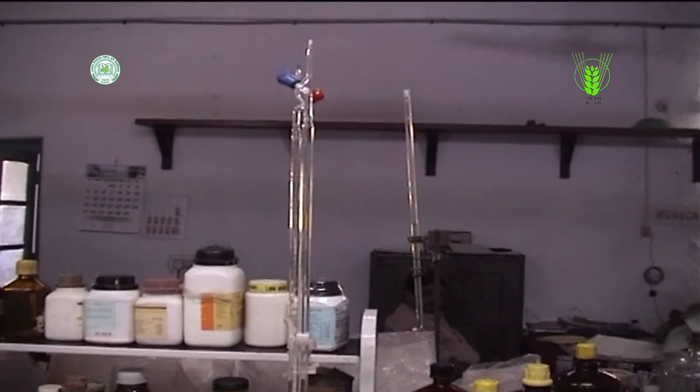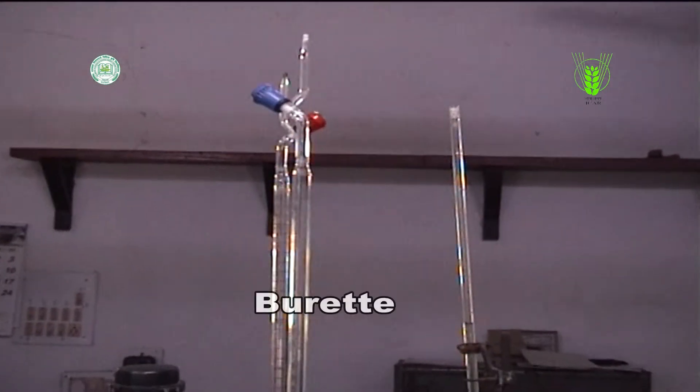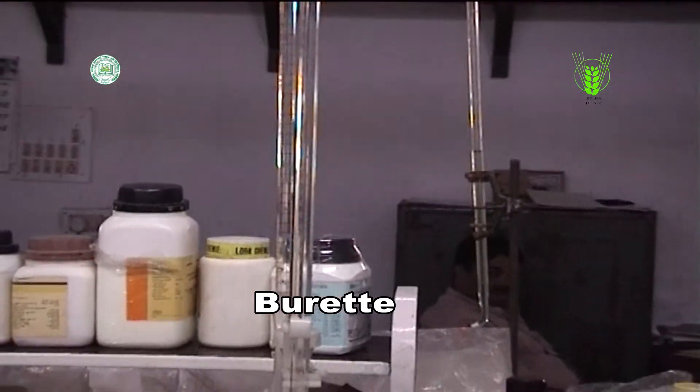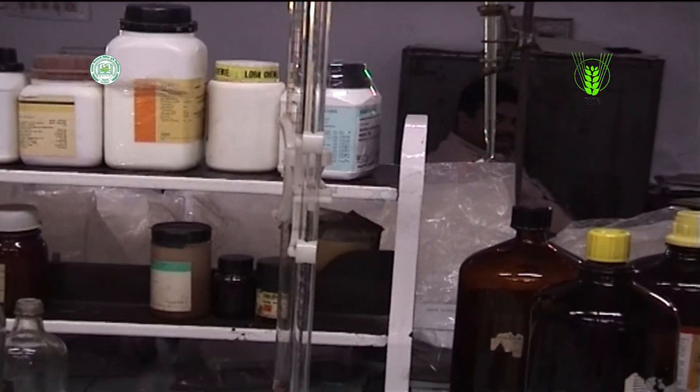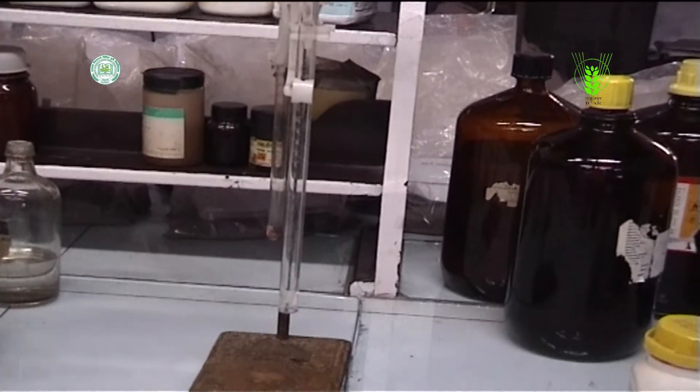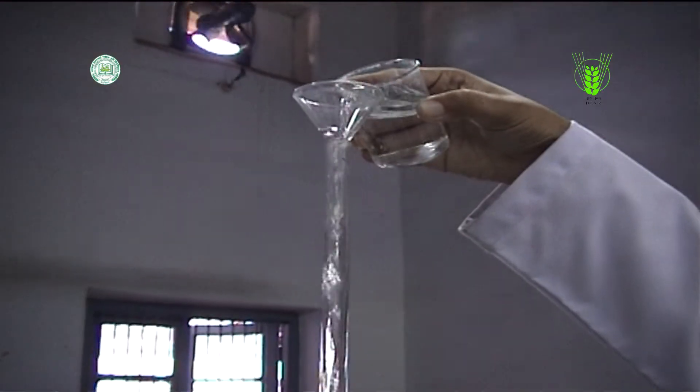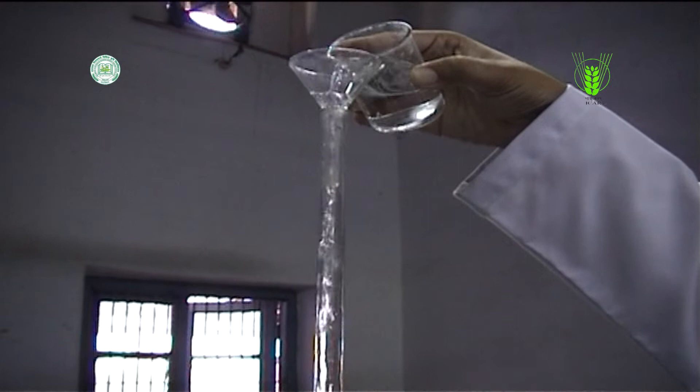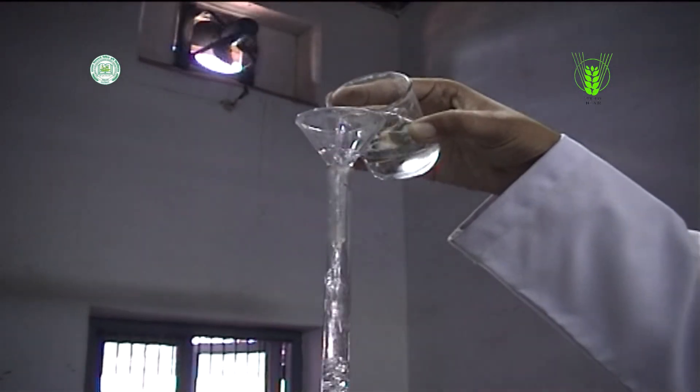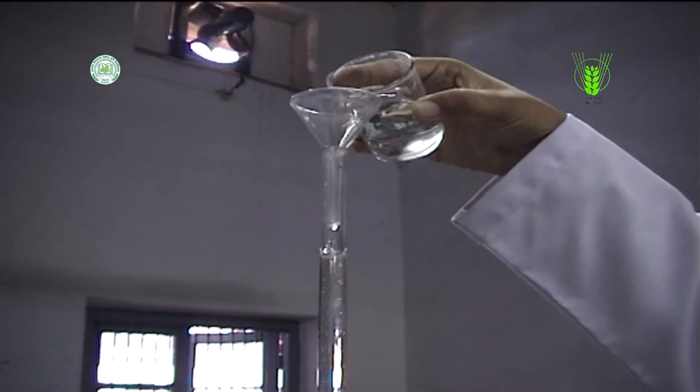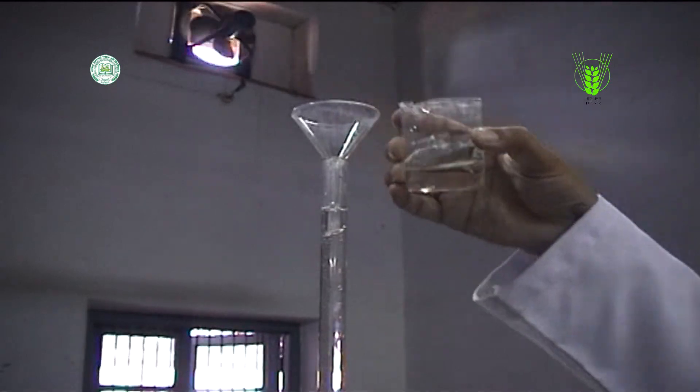Burette. Burette is a device used in analytical chemistry for the dispensing of variable measured amounts of chemical solution. A volumetric burette delivers measured volume of liquid.